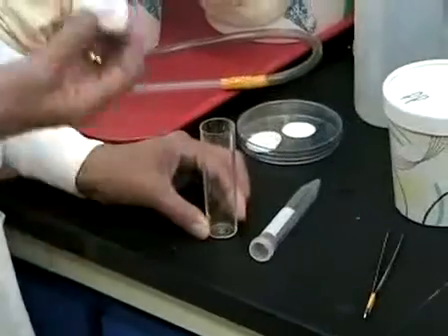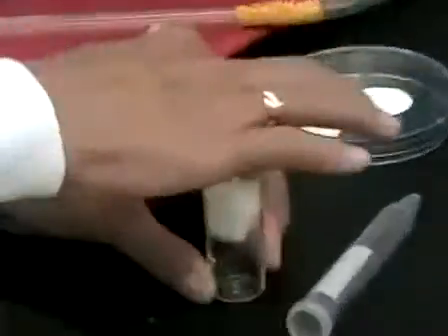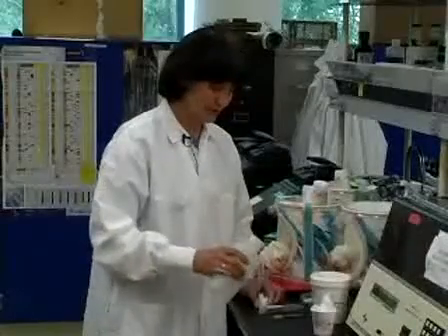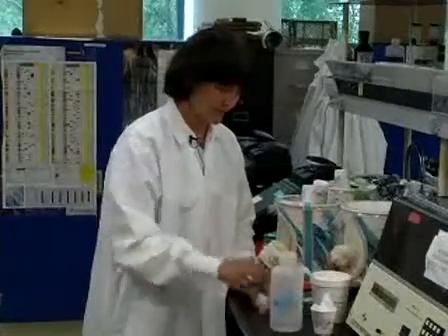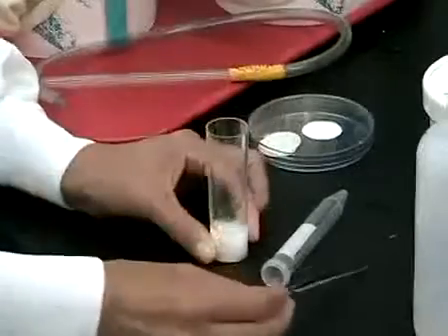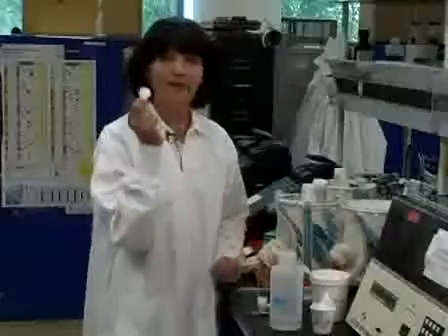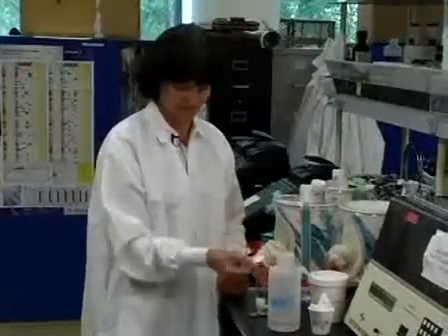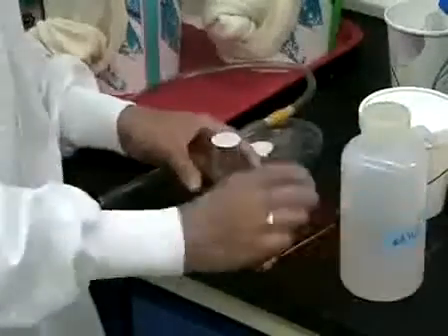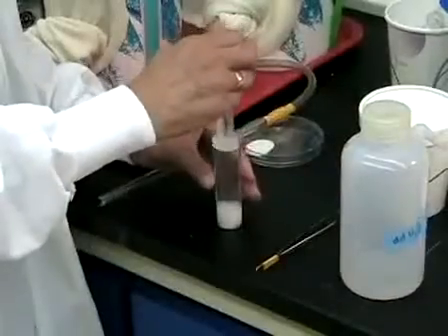This is a Drosophila vial. I am taking the cotton, putting it in, and pouring the water. Cotton is supposed to be wet. Then take a 3mm Whatman circle, put it on the top, and push down.